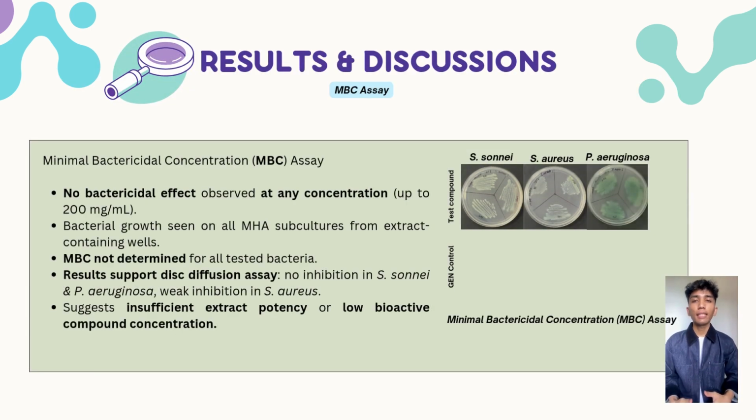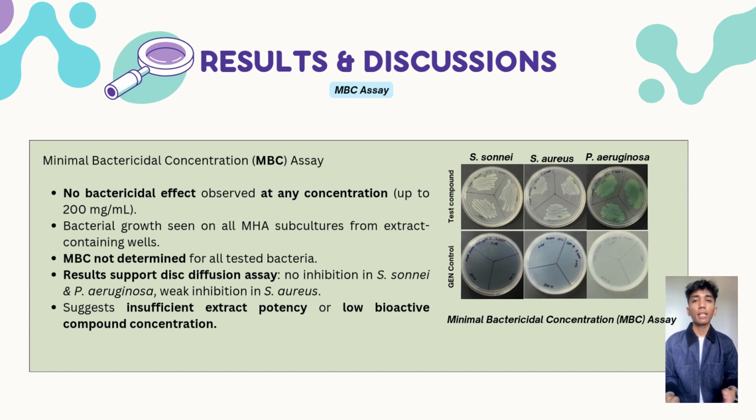Similarly, the MBC test showed bacterial growth in all subcultures from extract-containing wells, even at the highest concentration. This means that the extract was not sufficiently bactericidal or had a low bioactive compound concentration, which aligned with the results from the disc diffusion and MIC assays.